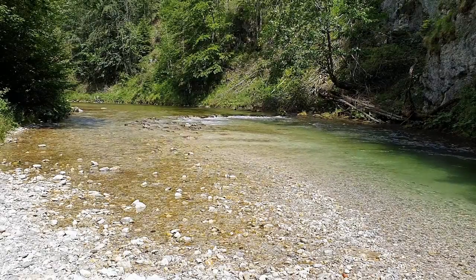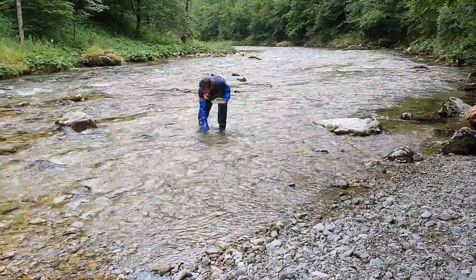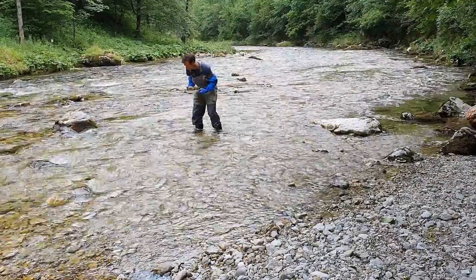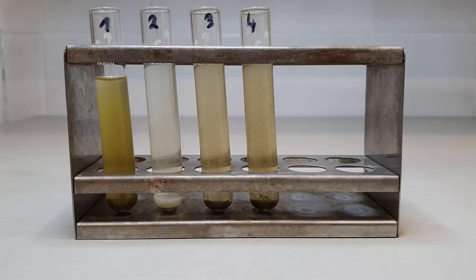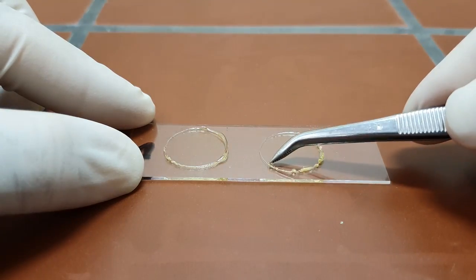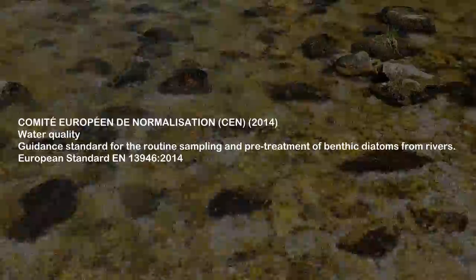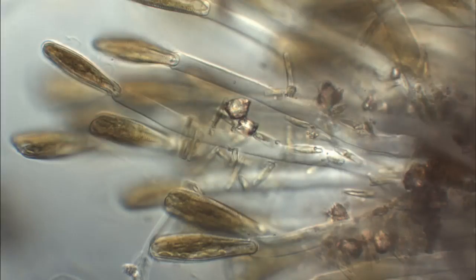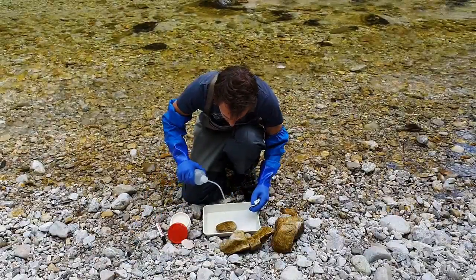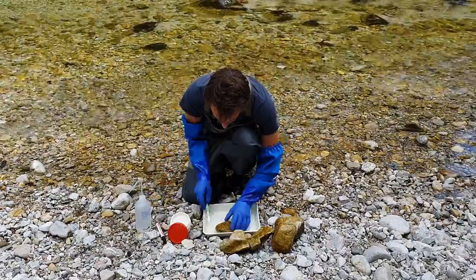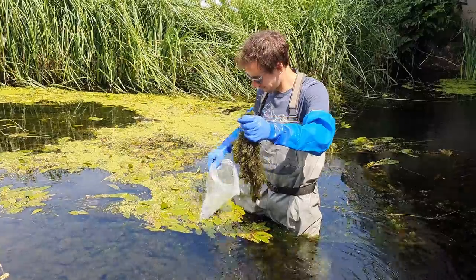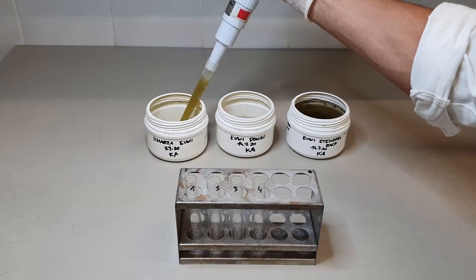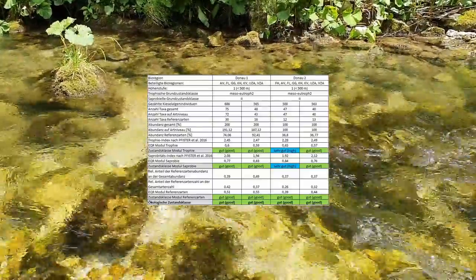Hello and welcome to our diatom training video. In this part of the video we are going to demonstrate sampling of benthic diatoms in rivers following the instructions of the European standard. The second part of the video will be all about processing the collected material in the laboratory. The European standard covers all aspects of diatom sampling in flowing waters relevant to ecological status assessment using benthic diatoms. This video aims to give practical examples and guidance for the methods described by the standard. Following these sampling instructions will result in samples suitable for quantifying relative numbers of benthic diatom taxa present and can serve for calculation of diatom water quality indices.